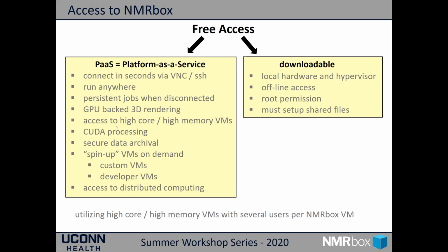I'll talk about that in a minute. Our GPUs are high-end NVIDIA GPUs that support CUDA processing. So the software that does support CUDA processing will have the ability to utilize the GPUs for processing. We have secure storage. We can also offer to spin up VMs on demand. So if somebody needs a custom VM for a workshop, or if a developer has some needs, we can help spin up VMs for users.